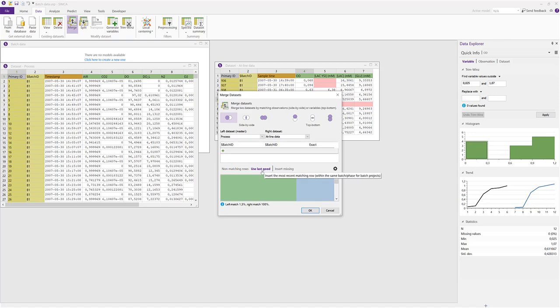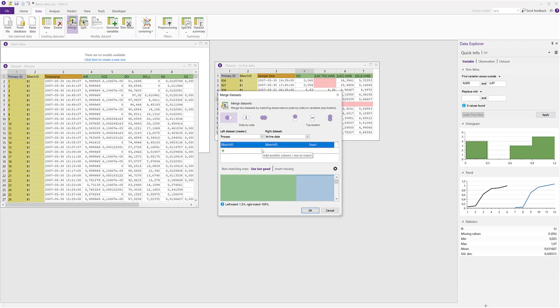In a SIMCA batch project, all data sets must have a batch ID column, and this is then by default selected as an exact match in the merge dialog. For regular projects, there is no mandatory matching column selected in the merge dialog. We can then add additional criteria by clicking on the plus sign in the empty row below the batch ID.